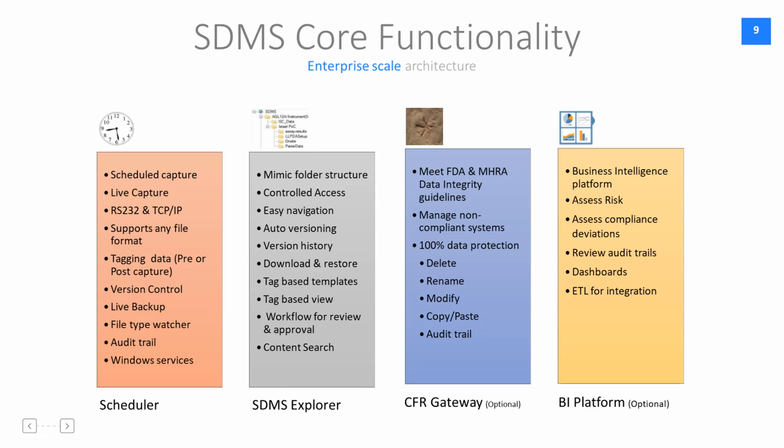This slide gives the core functionality of LogiLab SDMS. LogiLab SDMS has been designed for any laboratory of any scale and to enterprise scale architecture. The core functionality of LogiLab SDMS is the scheduler. Scheduler can capture data generated by instruments.